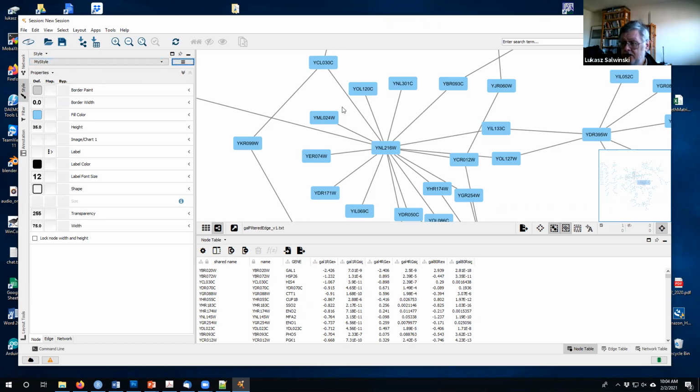So let's select my style, and now I want to show the gene here, instead of the label corresponding to the name of the node. First I've got to find where it is specified that this is what's showing up as a label. Well, there's a label, and it does have something in a column called map.